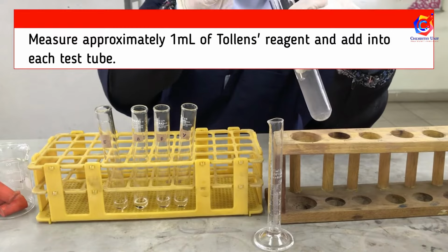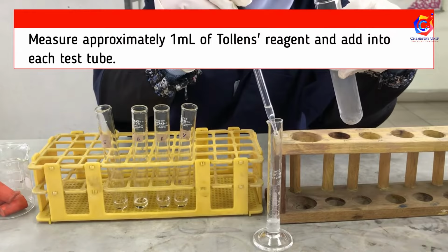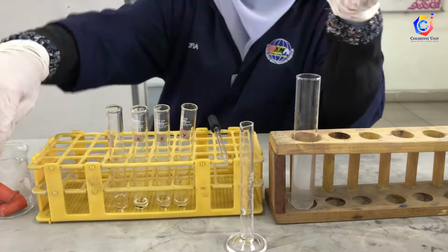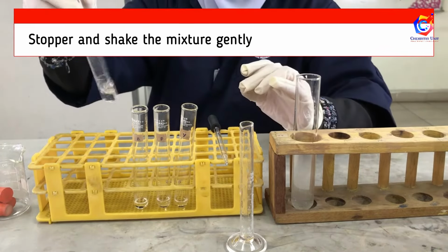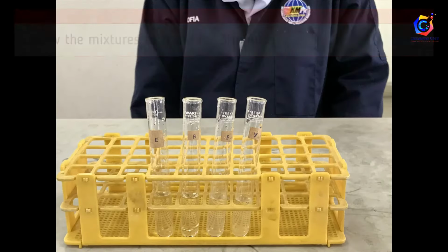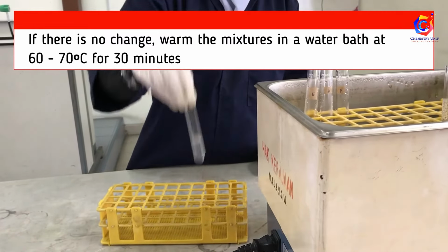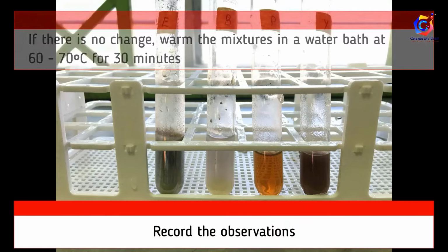Measure approximately 1 ml of the Tollens reagent and add it into each test tube. Stopper and shake the mixture gently. Allow the mixtures to stand for around 3 minutes. If there is no change, warm the mixtures in a water bath at a temperature within 60 to 70 degrees Celsius for around 30 minutes and record the observations.